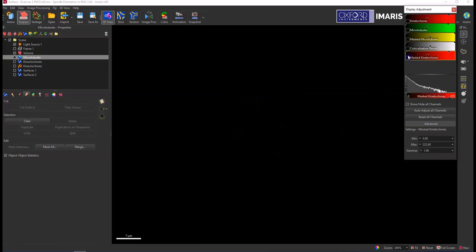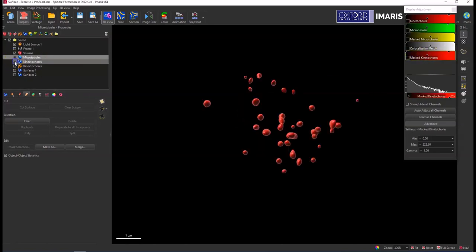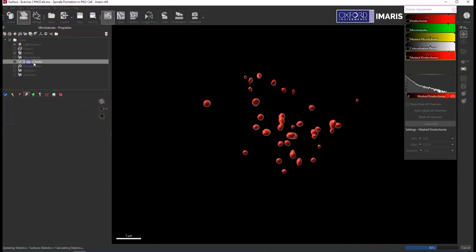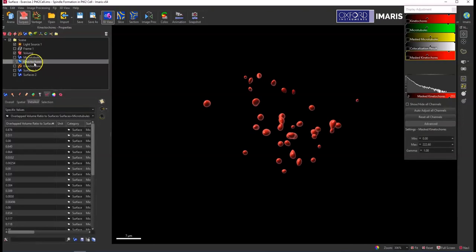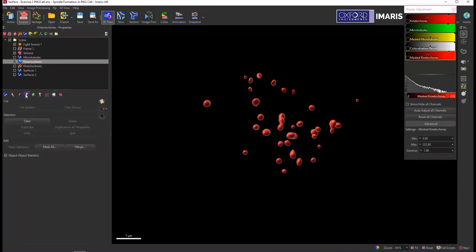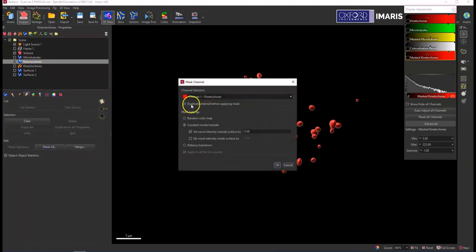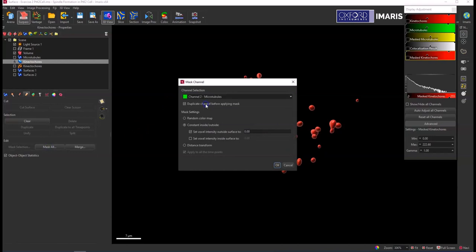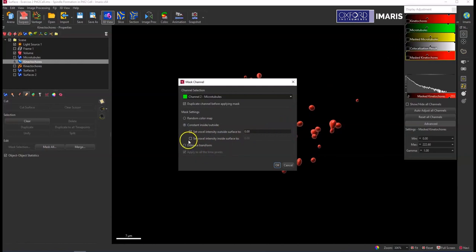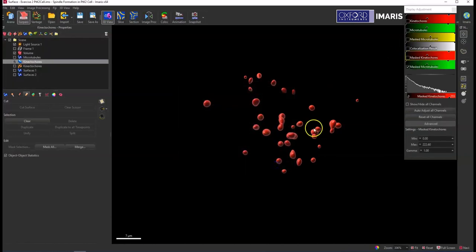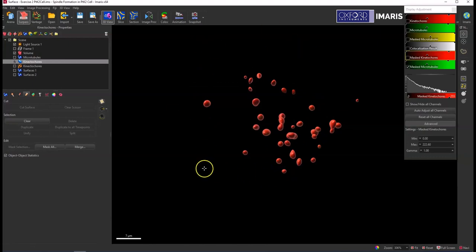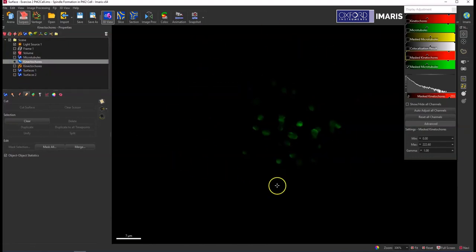I can also do the opposite and go to this kinetochore surface, go to the edit tab, mask all, but this time select my microtubule surface and set the voxel intensity outside the surface to zero and leave this box unchecked to maintain that green channel that is within this kinetochore surface. And you can see that's what has been created here.